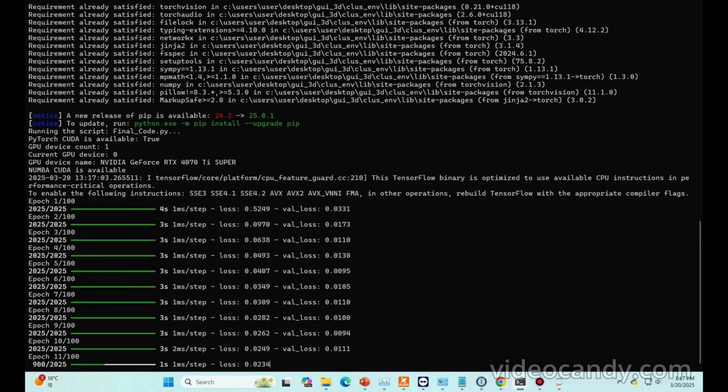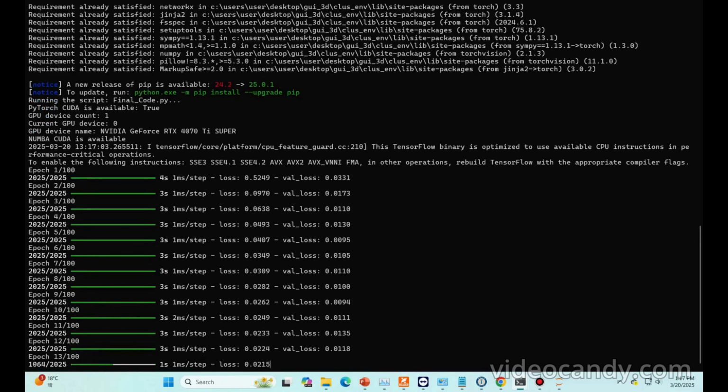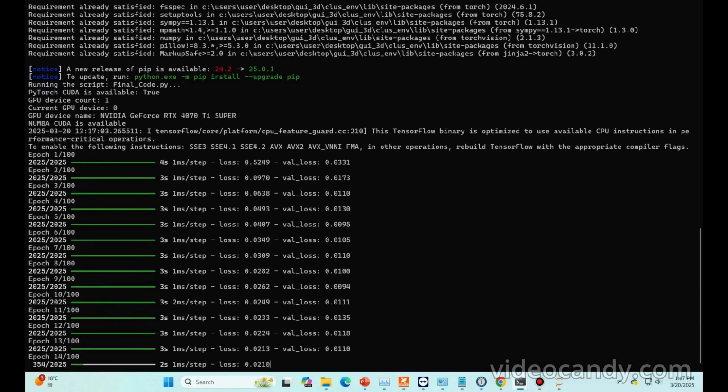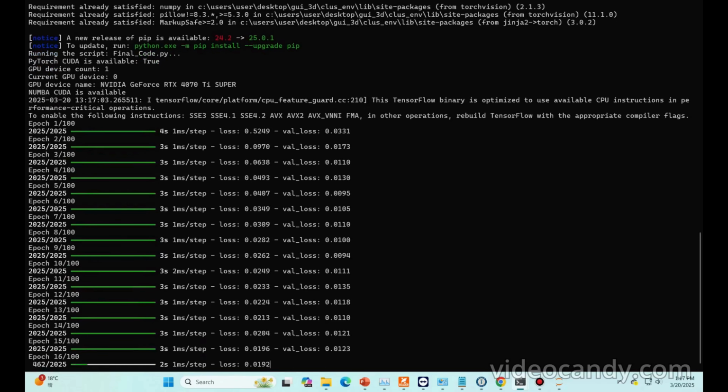I developed this project, and it will show some initial training, and then you can see how it works. Almost 5 epochs it will show, and later 5 to 10 epochs it will train, depending on how much separation power you entered.